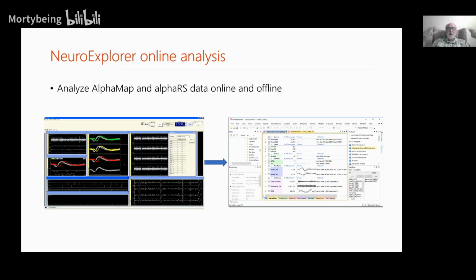For example, you run a spike triggered average or some kind of per event histogram for your receptive fields, and every 10 seconds it will redraw the graph that will show analysis results for the 10 seconds, 20 seconds, 30 seconds, etc. And then after 5 minutes, it will start again.